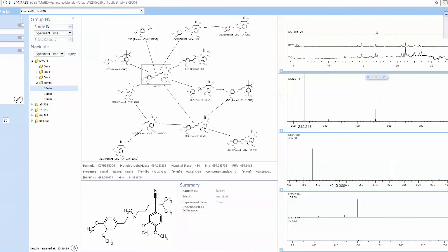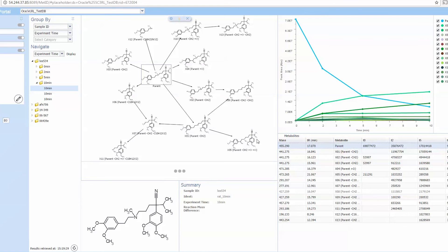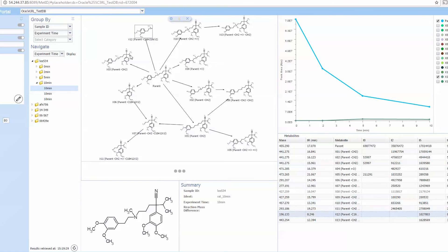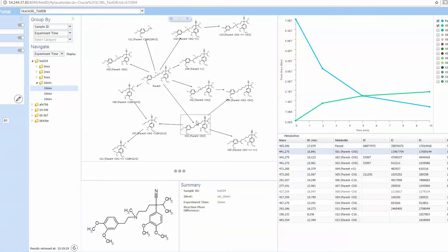You can switch to different screen forms and different layouts. In this case, we have the stability and kinetic plot, along with a table format, or a summary table. Again, you have different layouts available to you, and this can be fully customized for your needs.